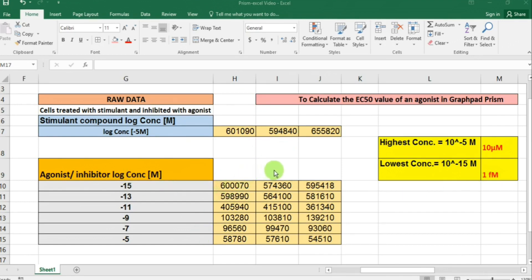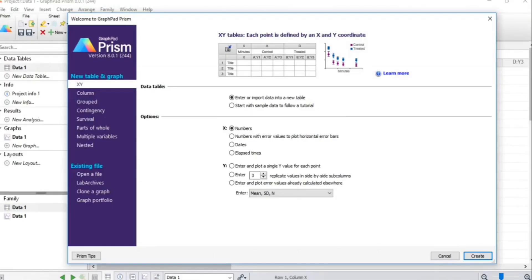This is how your Prism file looks when you open it for the first time. We are interested in plotting our values from the Excel sheet and drawing a concentration-response curve, which will be a sigmoidal curve.